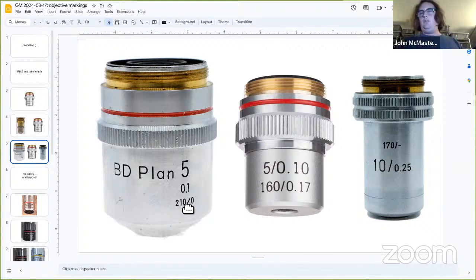You'll also see a few others like this 170 to the right, a little less common, but you do get other variants. I think that was Lomo maybe, which is kind of like an Eastern Bloc Russian microscope, had maybe 190. I'm sorry, that Lomo is 190. I think that 170 is not Zeiss, but one of the German microscope manufacturers. But 160 is really the most common, but I just want to put out there that there are other objectives.